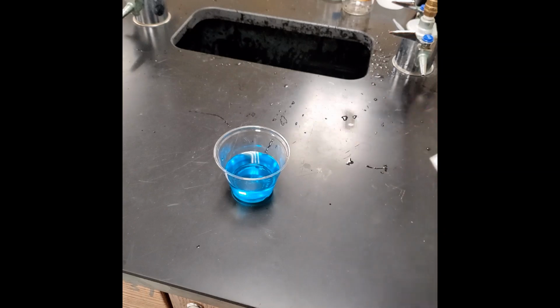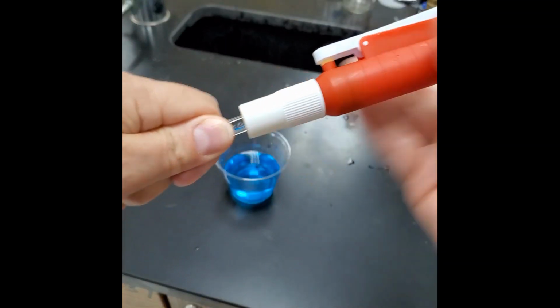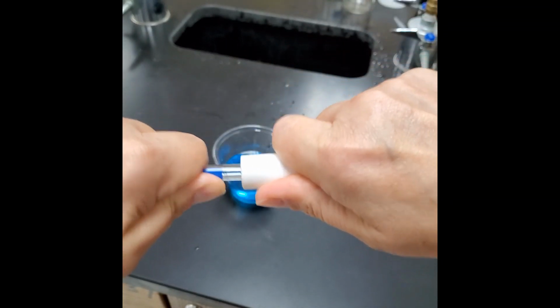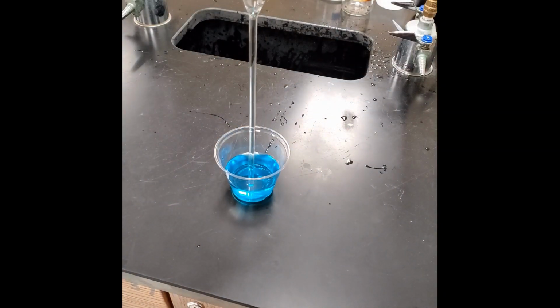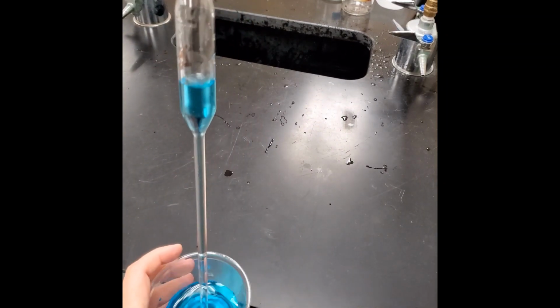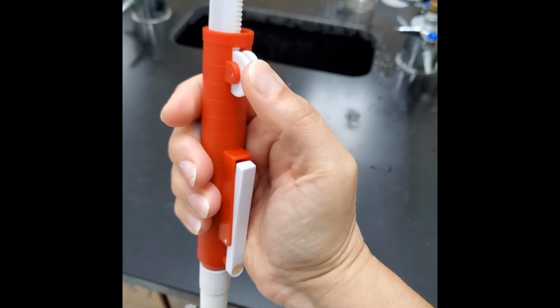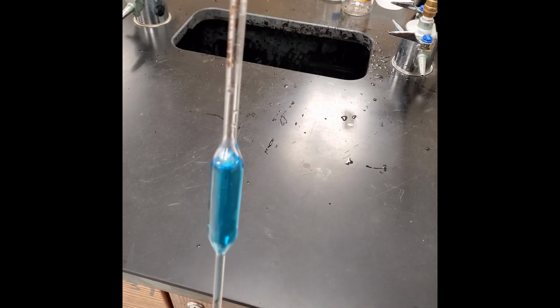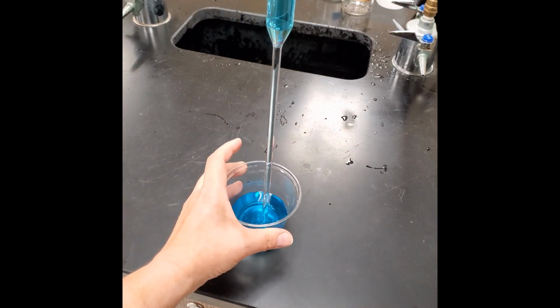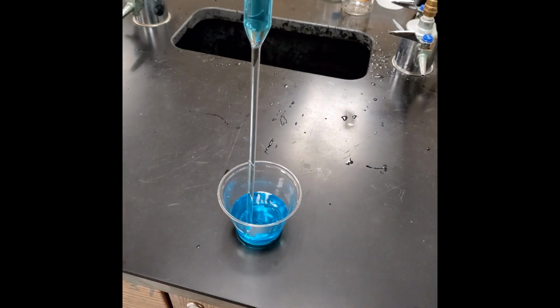So we're going to take the pipette. Remember, you're also going to hold it up close to the end. You're going to put this on so that it's nice and snug. Now don't jam it on, just put it on so that you get a nice seal. And then we are going to dial that little wheel down, and we are going to pull, and I'm going to just pull this down so that you can see what I'm doing. And we are dialing this so that the liquid comes all the way up into the pipette.